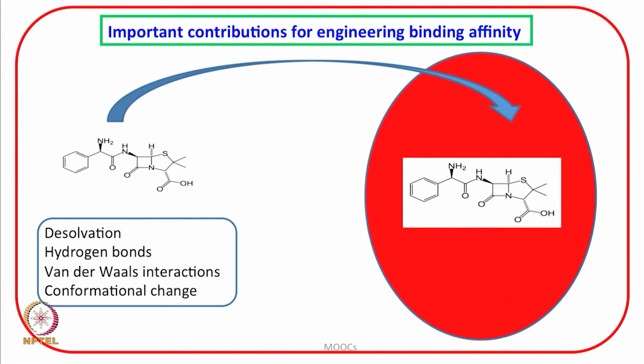It can be hydrophobic association also. There can be van der Waals interactions, and there can be conformational change. Desolvation, hydrogen bonds, van der Waals interactions, conformational change, and if there are largely hydrophobic groups, there can be hydrophobic interactions also.